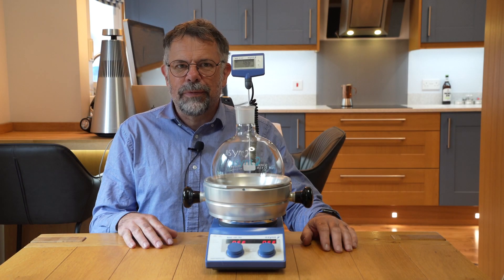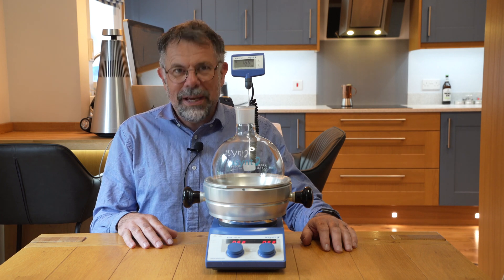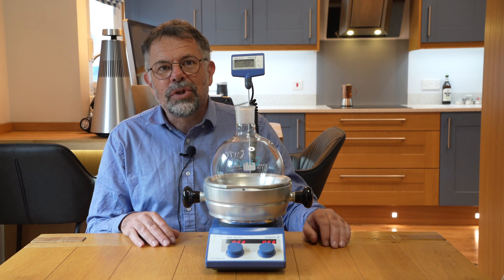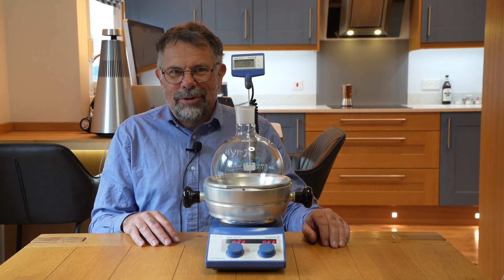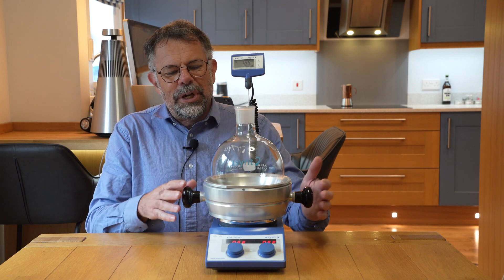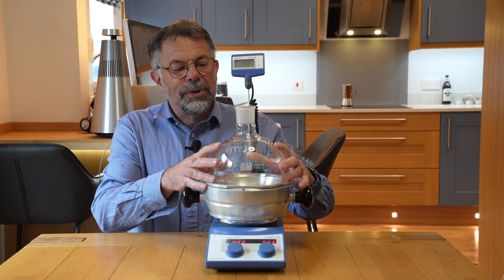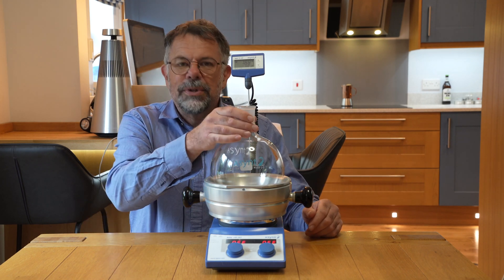Welcome to Ascent. My name is Martin Fordham and today I'd like to introduce you to our Drysyn Maxi. Drysyn Maxi is a larger scale Drysyn that you've seen so far on my videos in the kitchen here. This particular unit can do 2 litre size flasks as you can see, and it's adaptable and comes as a kit.